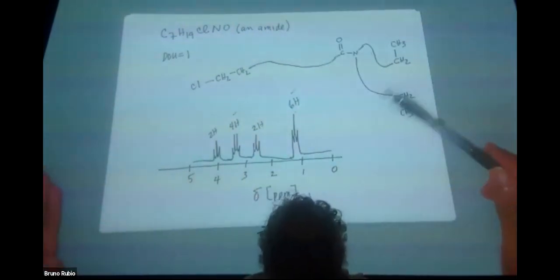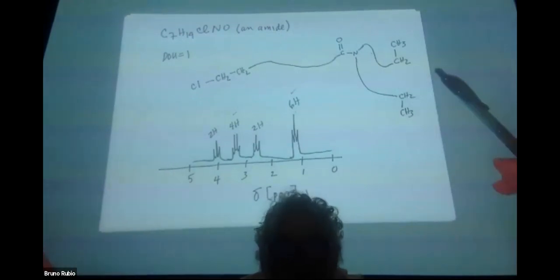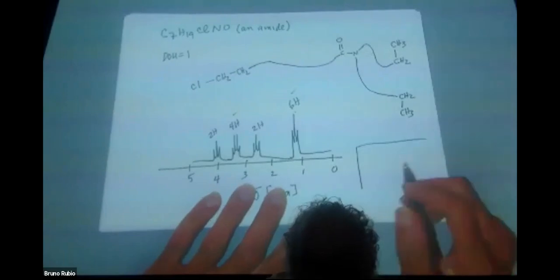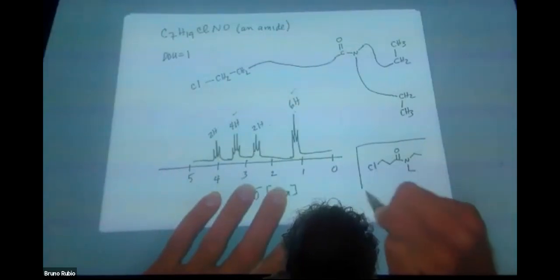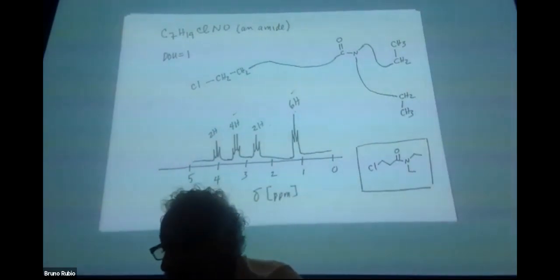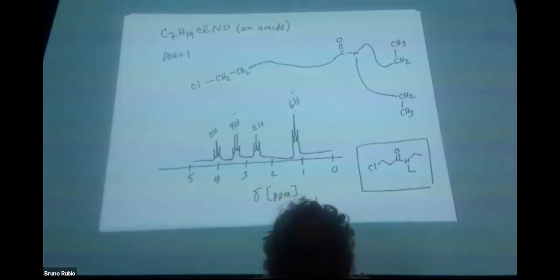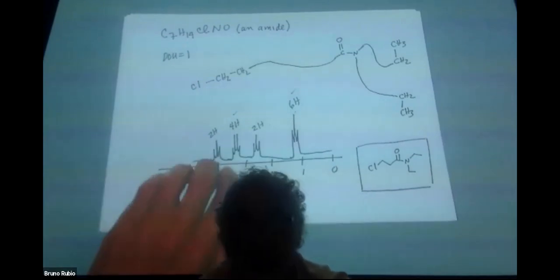All right, now this molecule, the way I've drawn it here, looks like something that maybe Dr. Seuss would come up with. So maybe in this little box down here, I'm going to just draw a prettier picture of what this thing would look like. And so this guy, a prettier picture, that would be the structure of the compound. This is what all of our NMR has been leading up to, being able to come up with the structure from the formula and the spectrum, right? This isn't that easy, right? This is pretty hard. And the only way you're going to get good at it is by practicing it. Okay, let's try again before time runs out and we have to do the quiz.